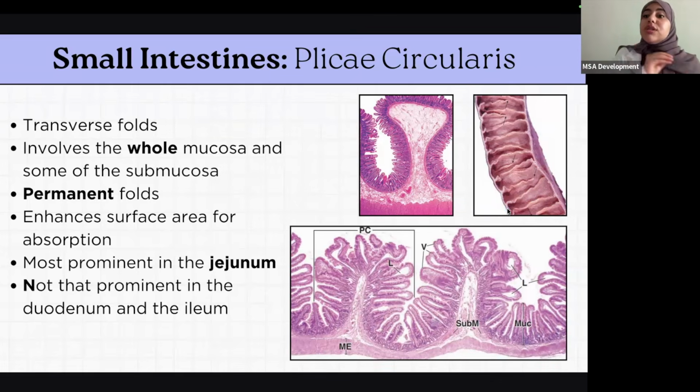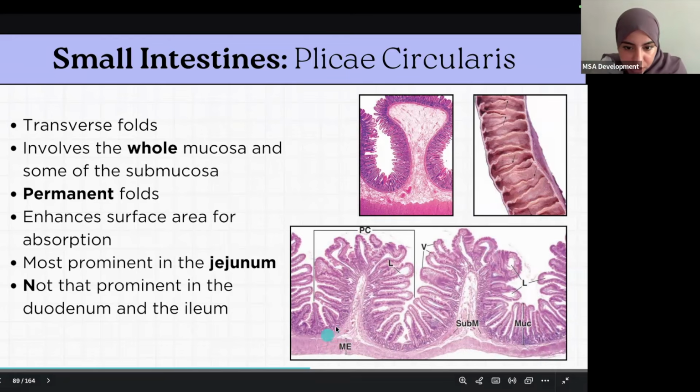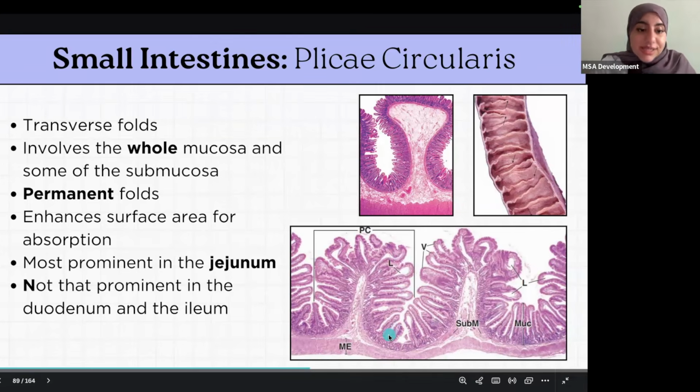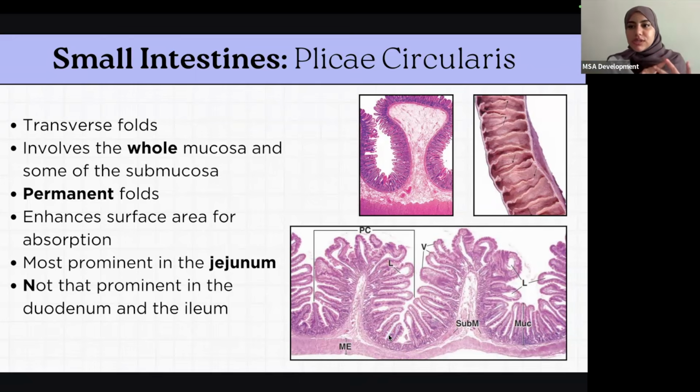because it's used to extend the stomach. Now, the small intestines aren't extendable. Their main goal isn't to extend, it's to absorb. As you can see over here, there are still projections, but there are so many villi coming off of these projections along with the simple columnar that's lining all of these. It's so difficult to actually extend it. So this is what you call a permanent fold. It's not meant to extend. It's meant to max out its absorption. It's a little bit more rigid. Both of them project into the mucosa and submucosa. However, this is more rigid.